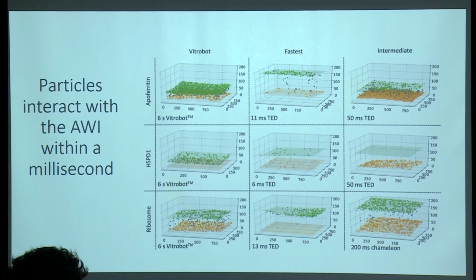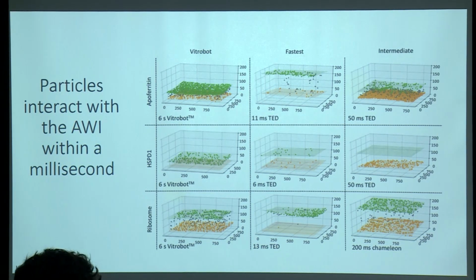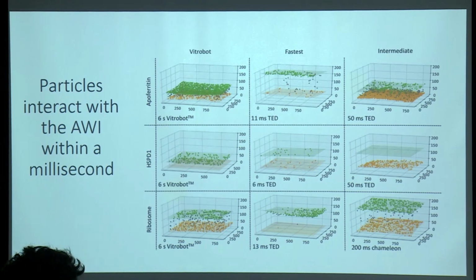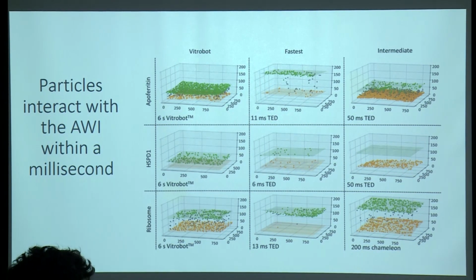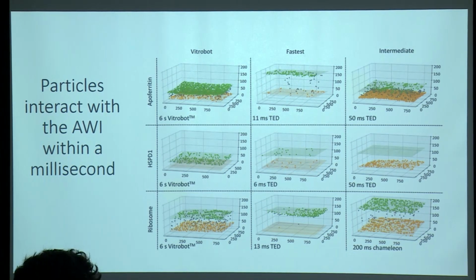But really the take-home from this is that even when we make grids as quickly as we possibly can, almost all the molecules that we are looking at in our cryo-Electron microscopy grid are up at the air-water interface. So this air-water interface is actually a fascinating environment that's very, very different from the kind of environment that exists in bulk solution, when we're purifying our proteins. And we know theoretically that our proteins can be exposed to forces at the air-water interface that might make them adopt non-native conformations or impact our downstream structure determination process. So the first thing we knew is that our proteins were up at this air-water interface. So what are they doing when they get up there?